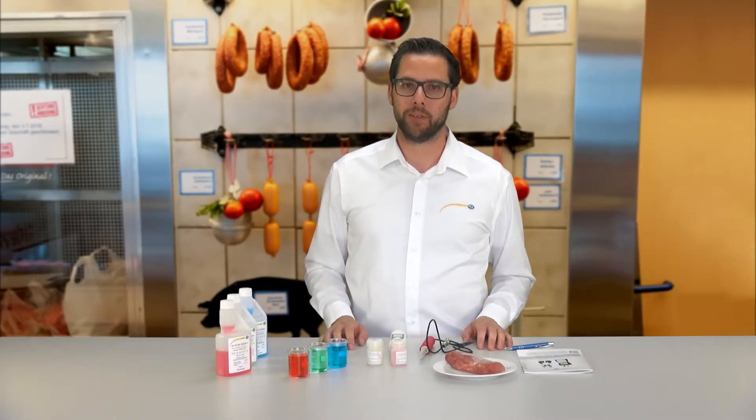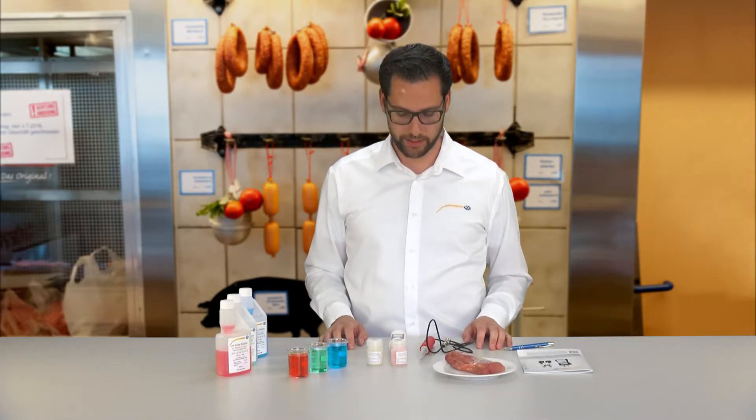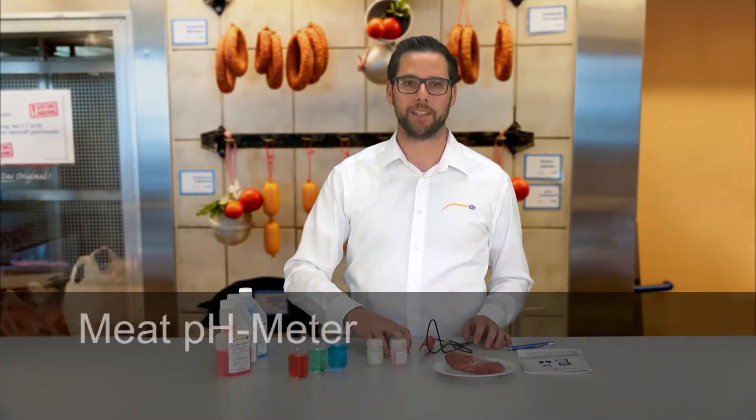Hello dear viewers, everyone welcome to PCE Instruments. My name is Julian Gebbert and I would like to present you today the PH-Meter PCE PH20M for meat and food.